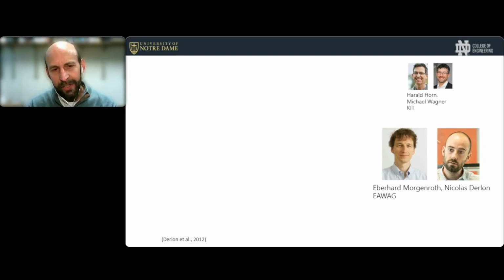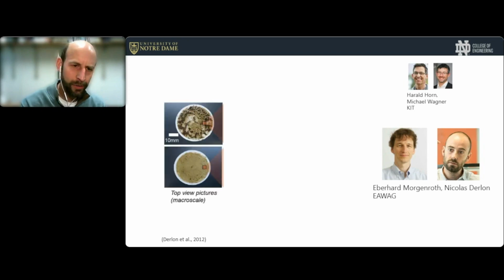So they were very interested in water filtration using membrane systems. And what they found was that, you usually expect filtration membranes to foul over time. A biofouling layer develops. They were filtering river water with a fair amount of organic matter, so you would definitely expect a biofouling layer to develop, and sure enough, it did. So here you can see a filter. I think this was fairly large, maybe 30 or 40 millimeters in diameter, and a biofilm developed. But you can see the biofilm is quite rough and patchy.